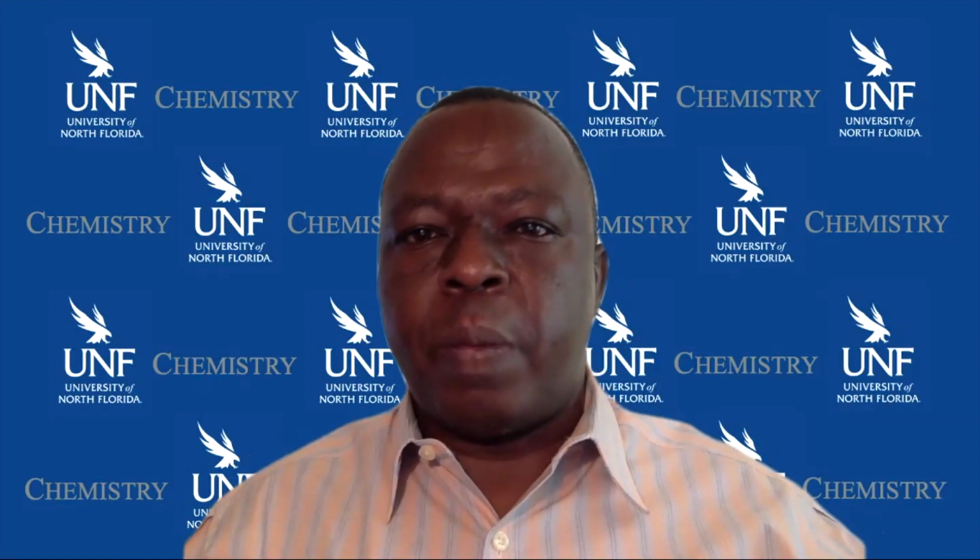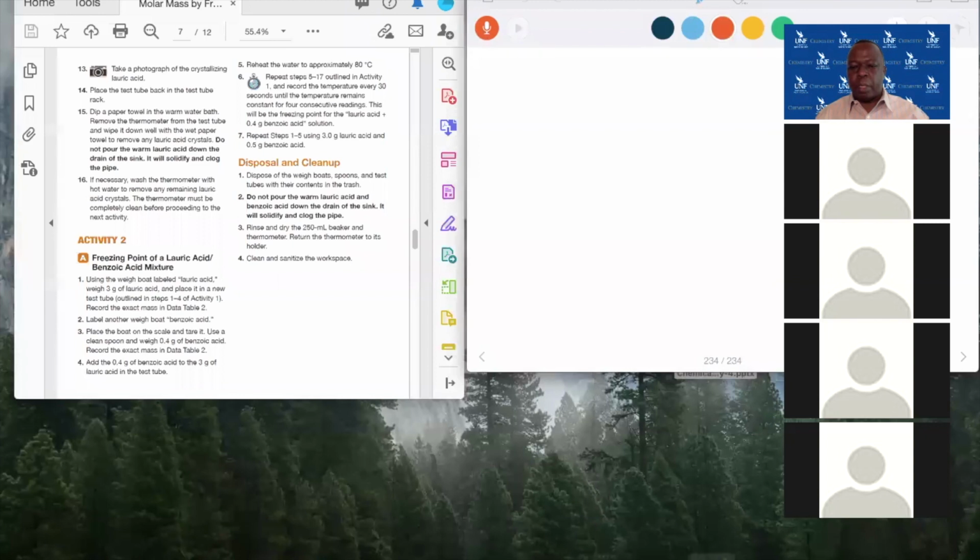The handout for this experiment, the procedure, is available online. It is posted in module number 3. Let me share my screen here and show you where the module for experiment number 3, colligative properties, is.